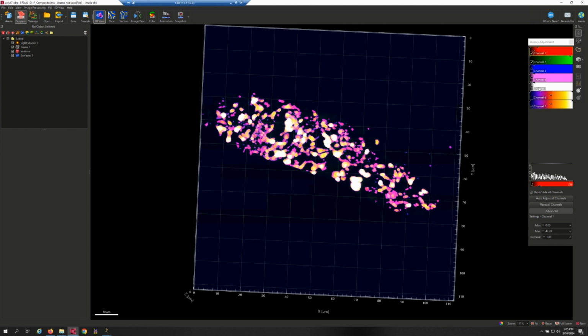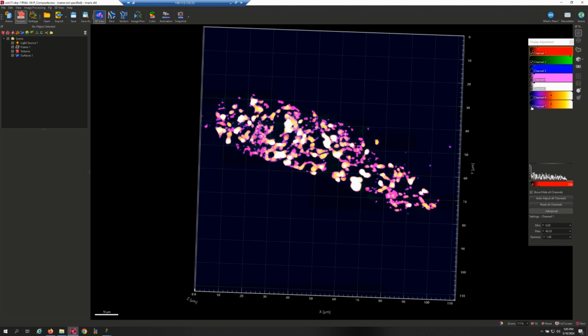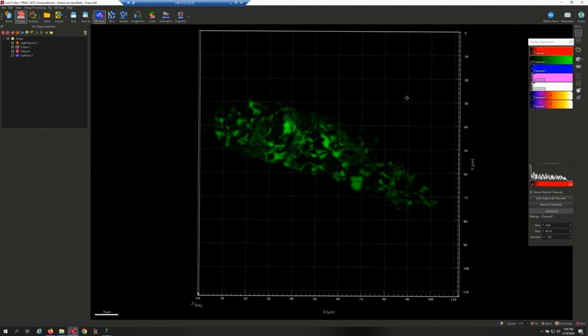It consists of 7 channels. Let me explain what these 7 channels are. I can first turn off the red line on the side. Let's start by looking at Channel 2. Channel 2 is the raw image, which is essentially the actual image result of mitochondria. You can adjust the brightness of this image using the endpoint here.